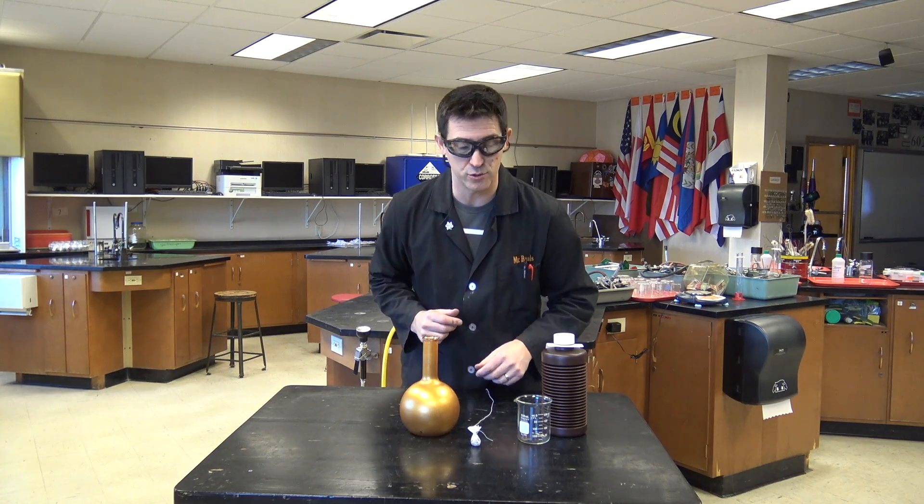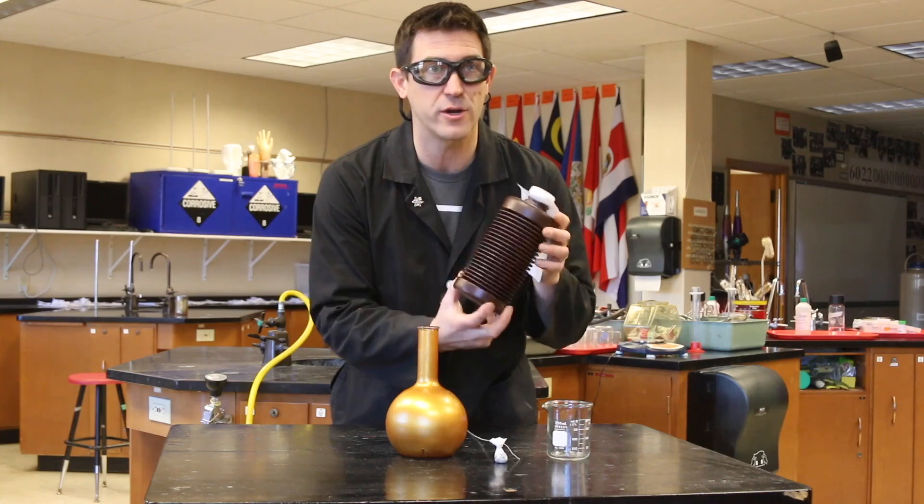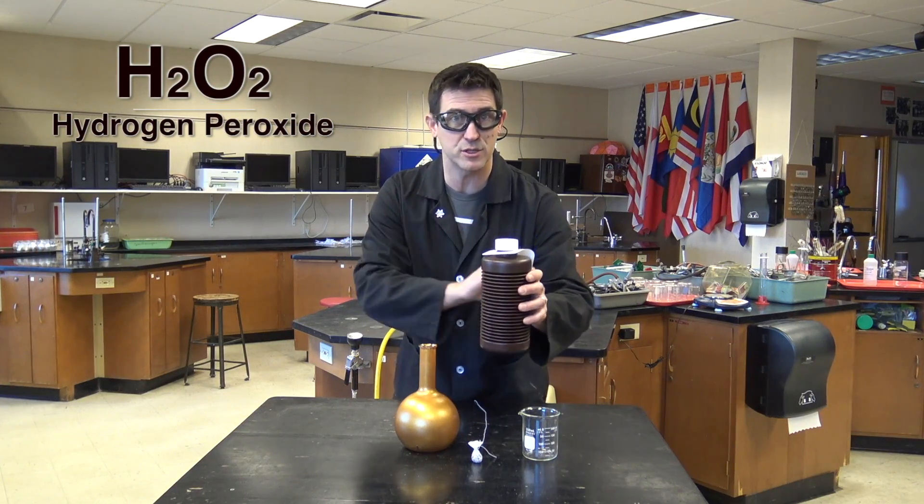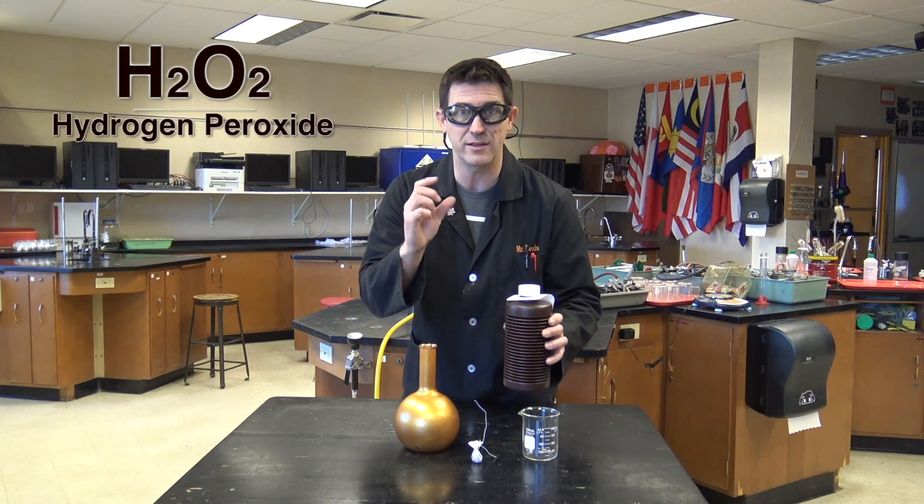This is not something that you should try at home, because we're using 30% hydrogen peroxide. This stuff is not the stuff mom puts on your cuts — this will burn right through your skin.